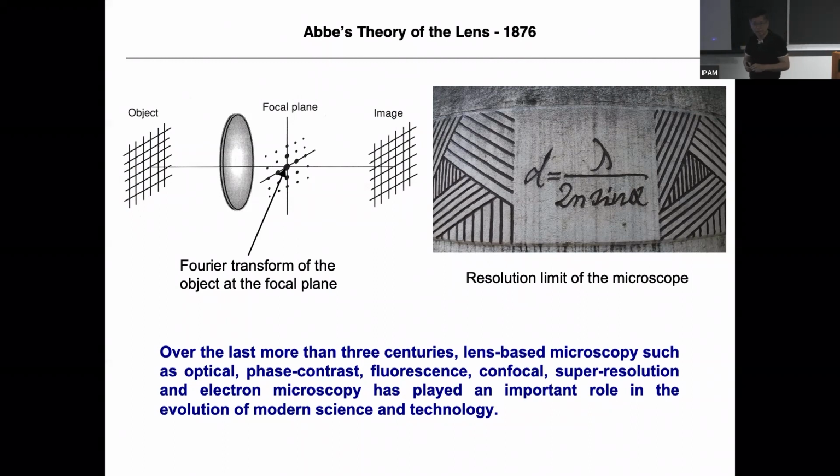Is that not the refractive index of the medium directly before the lens? Yes, it's the medium's refractive index. This is why for biological imaging lenses nowadays, you have to use oil, to increase n. You're right. Any question, please ask.